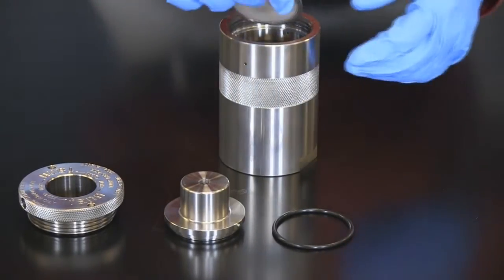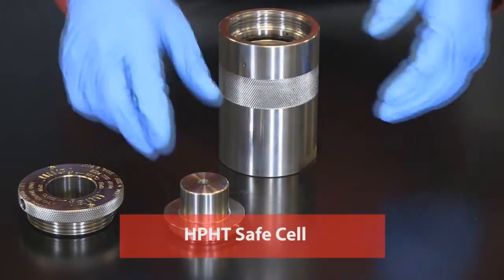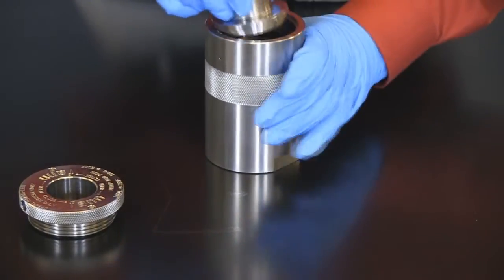It adds up to improved safety, reduced chance of pressure accidents, simplicity with easy operation without a lot of tools, and savings.